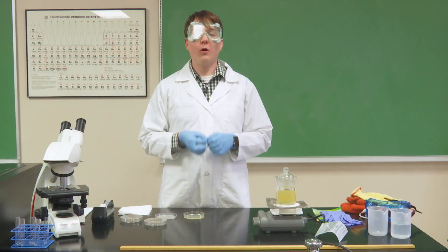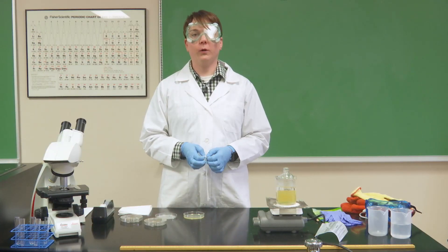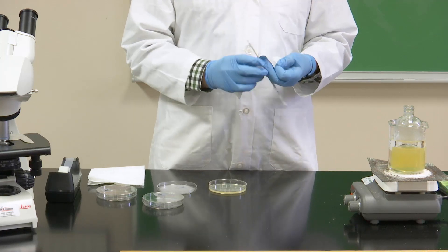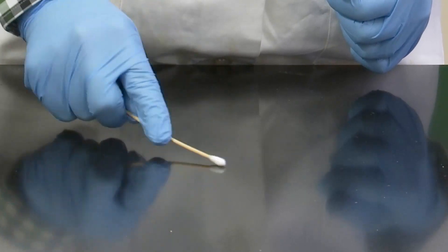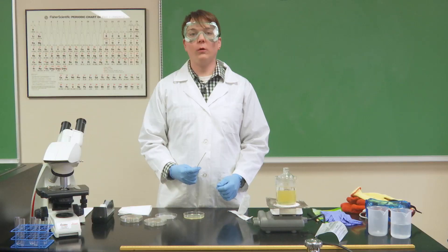Next, take your sterile swab, open it up, and rub it on the surface you want to test. Only test one surface with each swab. Again, you don't want to cross-contaminate.